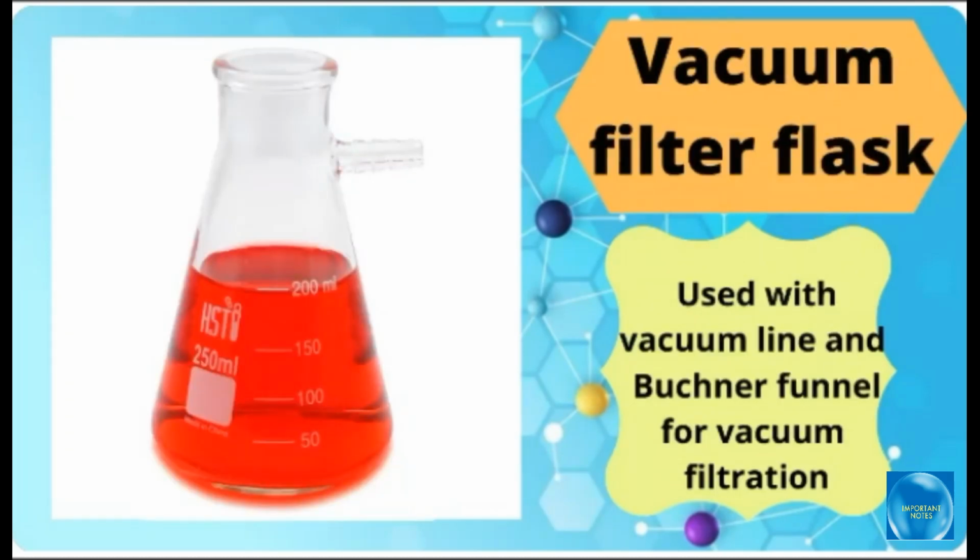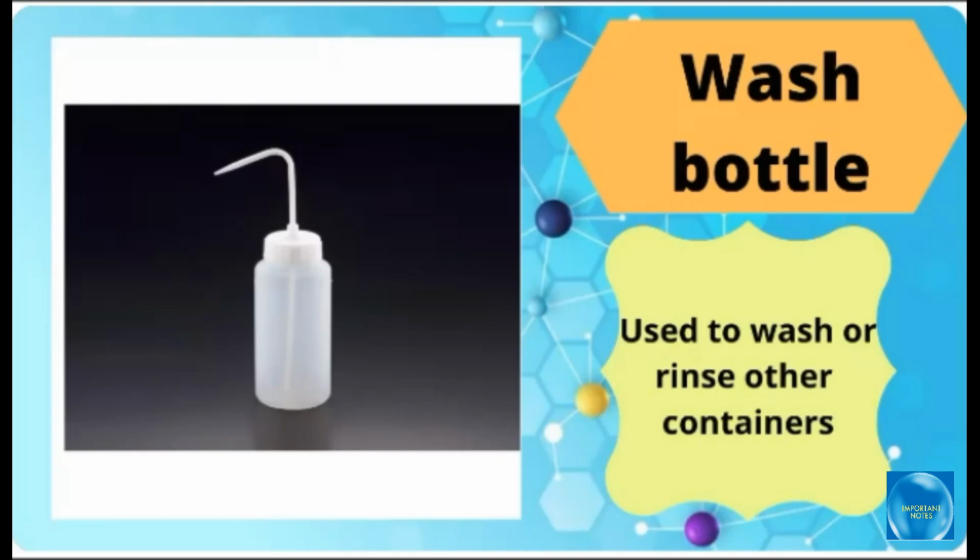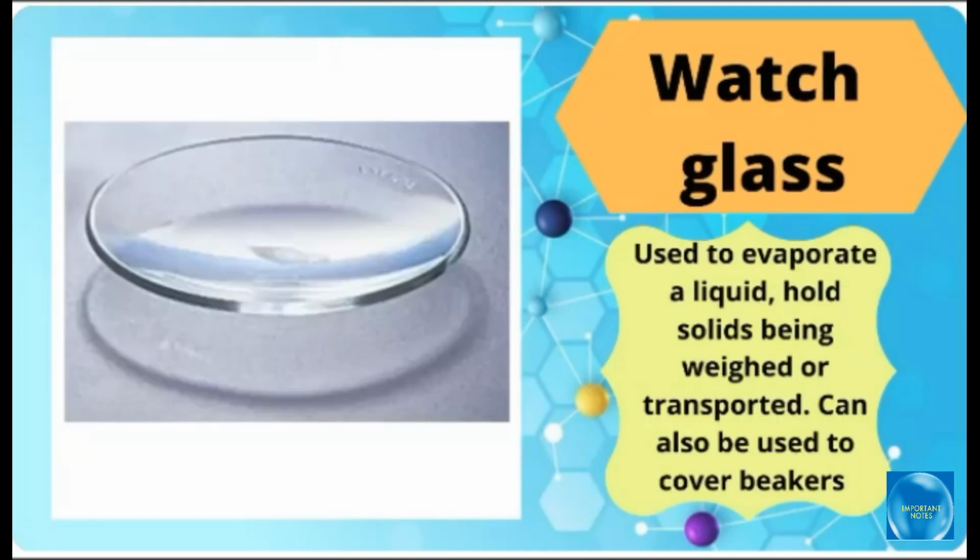Vacuum filter flask, used with a vacuum line and a Büchner funnel for vacuum filtration. Volumetric flask, used to measure one specific volume in mixing accurate solutions. Wash bottle, used to wash or rinse other containers.